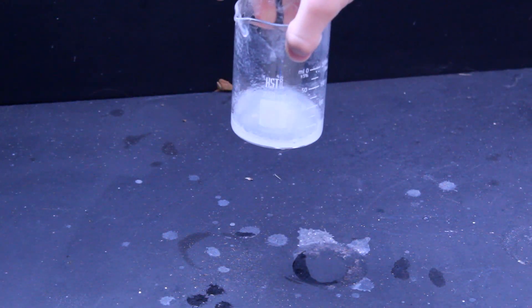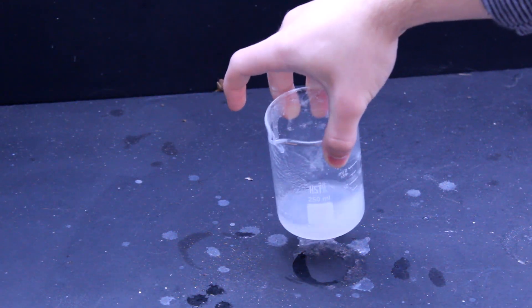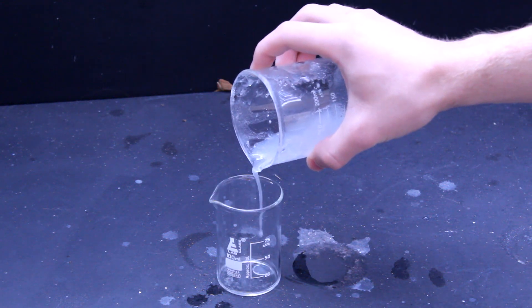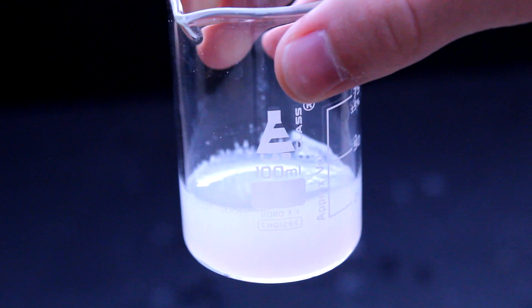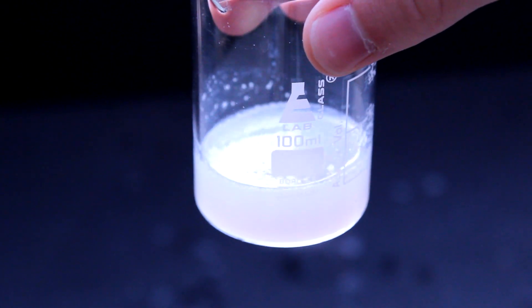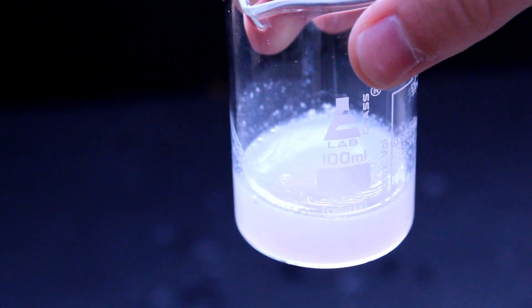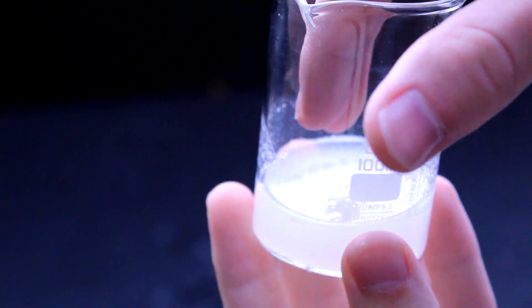Once all the acid is added, a white gelatinous precipitate will form. This is actually glass, or more specifically, a hydrated form of glass known as silica gel. Some of the silica is also still dissolved in solution as the compound known as silicic acid, which is actually pretty cool when you consider how insoluble sand and other forms of silicon dioxide are.